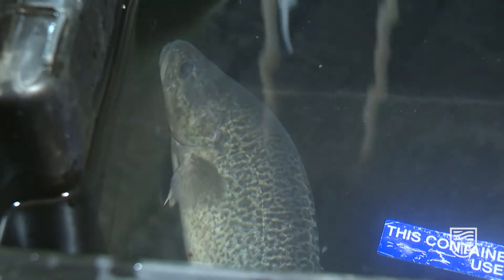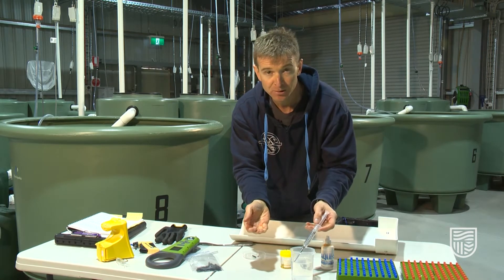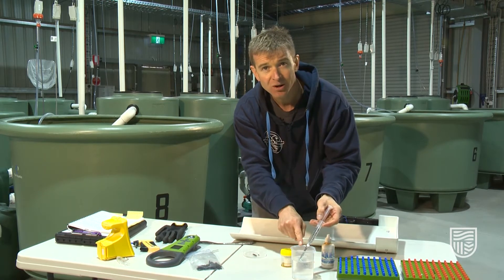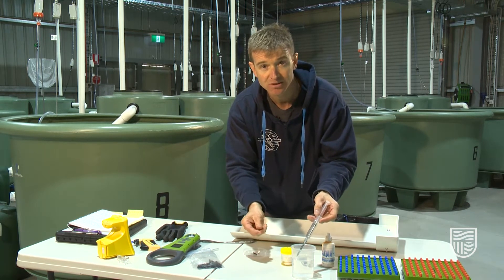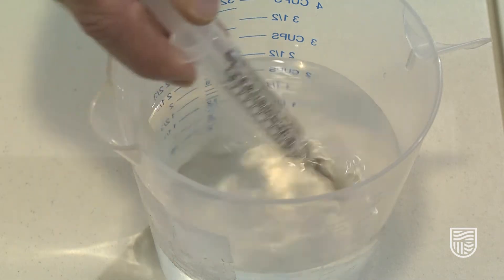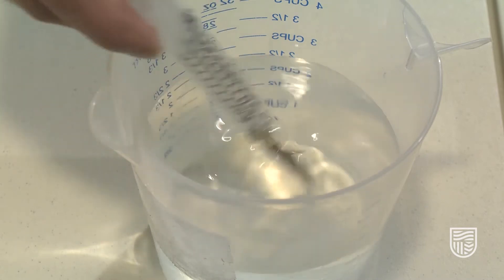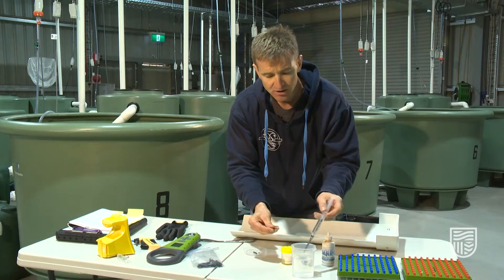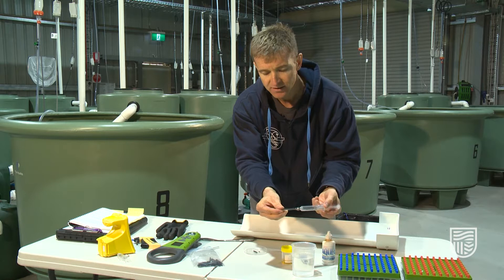We now take our tag applicator — this is the applicator for the 23 millimeter tag, which is appropriate for this size fish. We have the needle sitting in alcohol; this is pure alcohol to sterilize the needle so we don't inadvertently introduce diseases into the fish. Once the needle has been removed from the alcohol, it's good practice to rinse the needle again in a very low concentration saline solution, which can remove any of the strong alcohol and make it a little bit better on the fish.